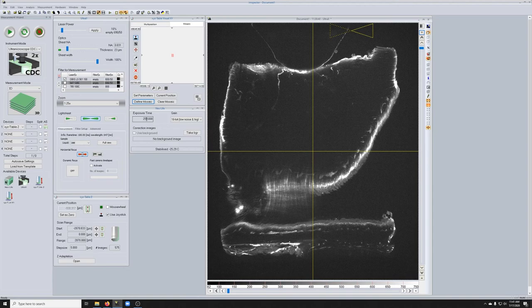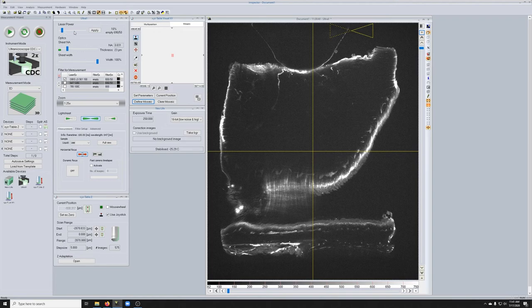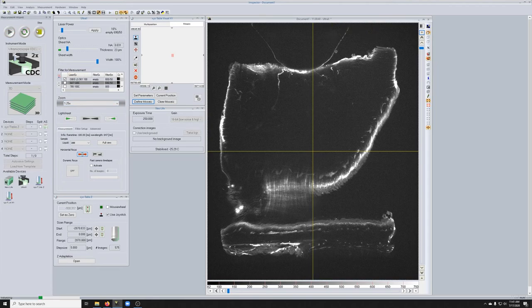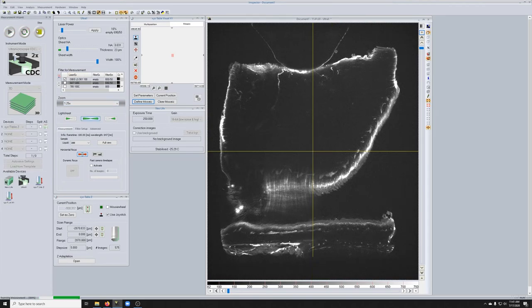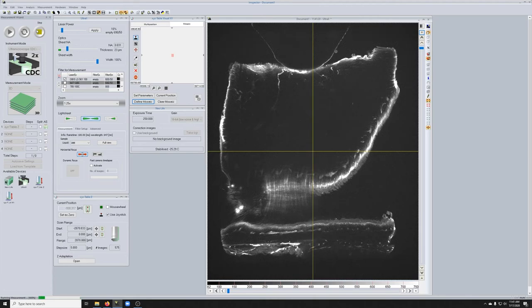And then right before we're about to image is when we try to minimize the exposure time and get the quality we want by increasing the laser. Let's first see what kind of quality we have and whether we need to modify the exposure time. This is our current with an exposure time of 250 milliseconds. I would say it's okay, but maybe not great.